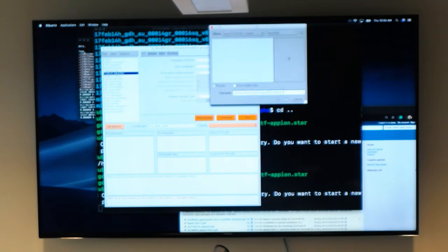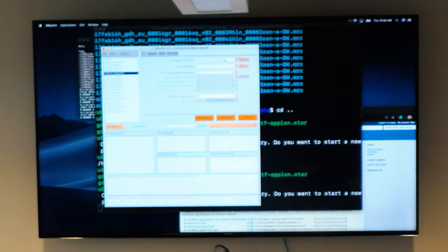and it has something called nodes, but we know exactly where we have our data, right? It's in home Ubuntu, the folder you created, so you can just go there, and we're going to find this micrograph star file that we downloaded from Appion, and this is the list of micrographs. And we already have coordinates. The coordinates are in micrographs, and they were output as box files.